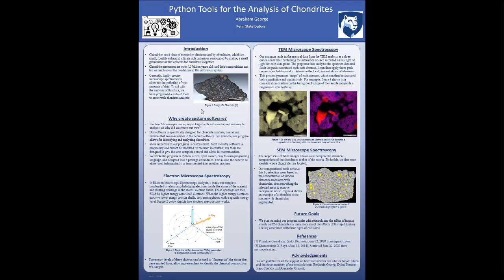So the second major type of electron microscopy is SEM. Now, for our purposes here, the main difference between SEM and TEM is SEM is at a larger scale. So whenever we look at these images, we usually get a picture of a whole cross-section or a large piece of the cross-section, rather than a zoomed in little bit of it like we get for the TEM.